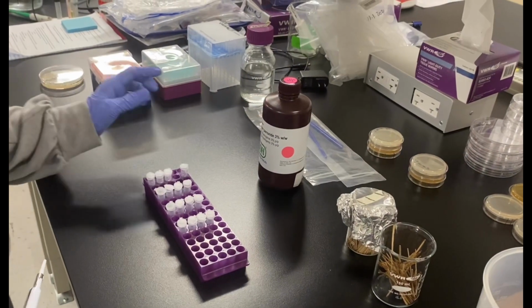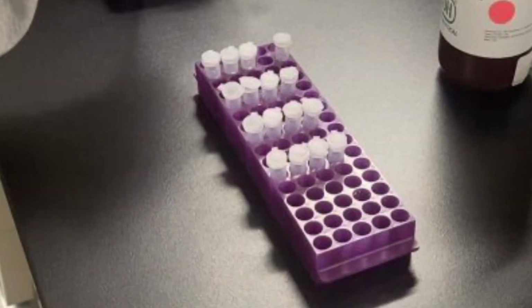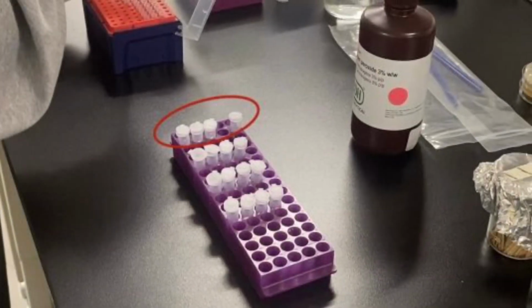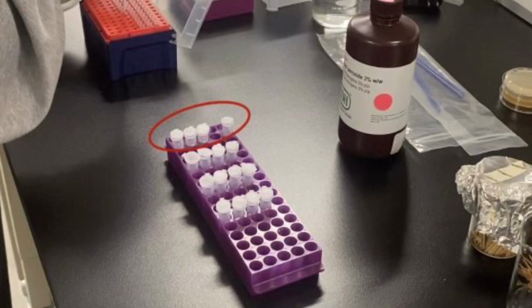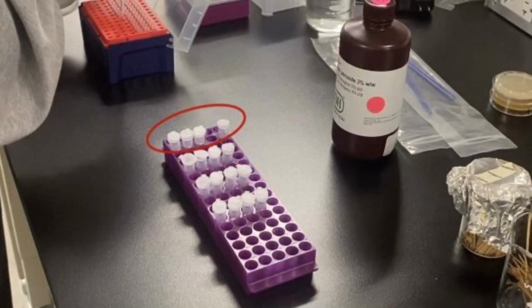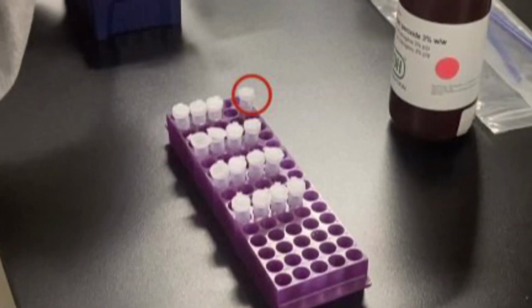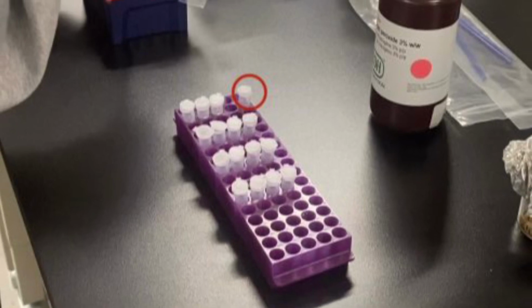For the hydrogen peroxide experiment, you must use 16 Eppendorf tubes. After properly labeling the tubes and adding 250 microliters of sterile water and a pin-sized amount of wild-type culture into each of the first 4 tubes, set aside the first tube, HP0. This tube HP0 is your control. You will not be adding any hydrogen peroxide into this tube.